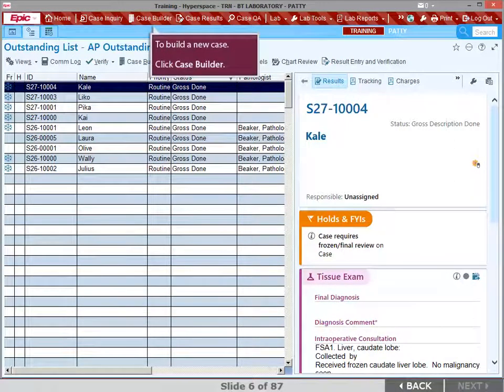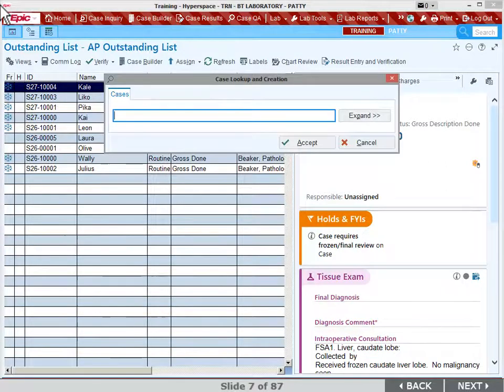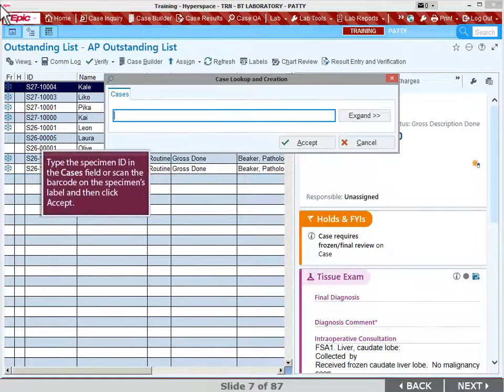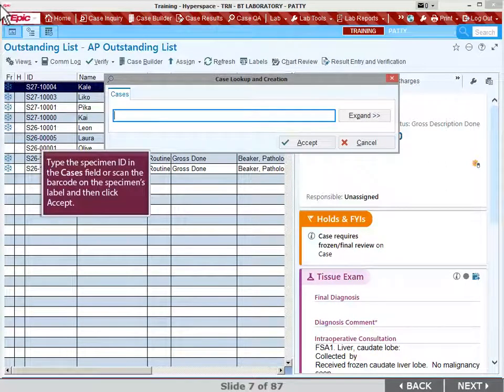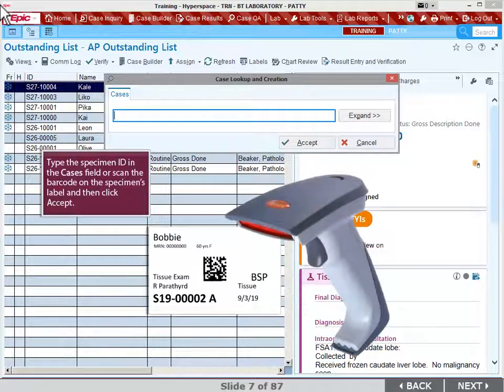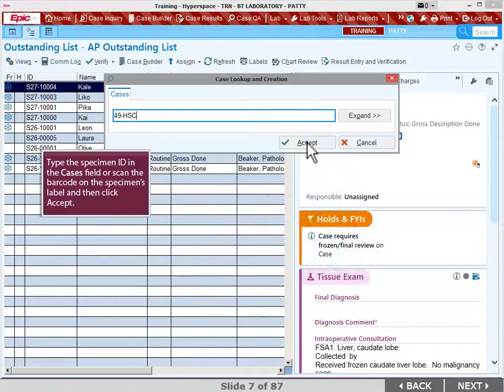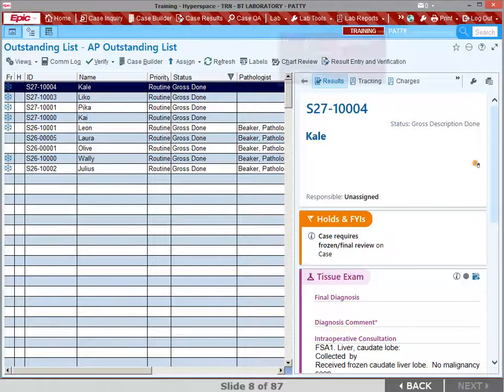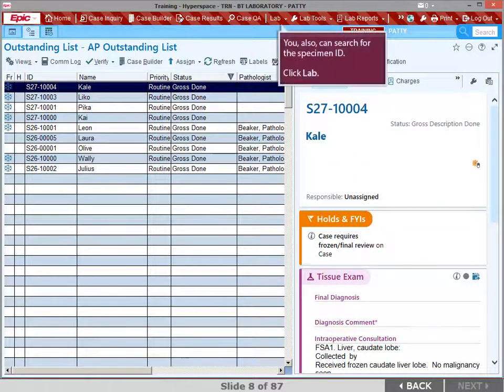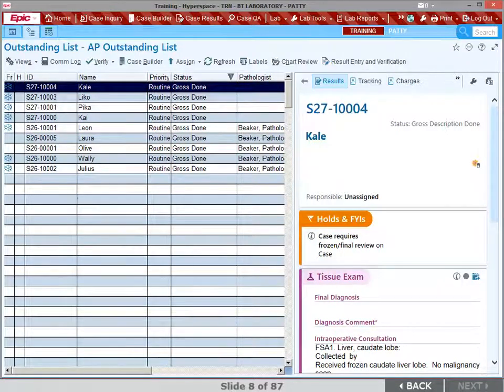To build a new case, click Case Builder in the Epic Main Toolbar. Type the specimen ID in the Cases field or scan the barcode on the specimen's label and then click Accept. You can search for the specimen ID under Case Receiving.